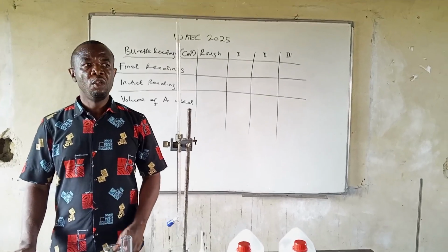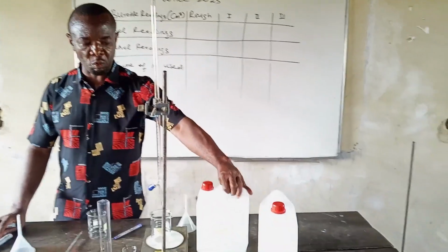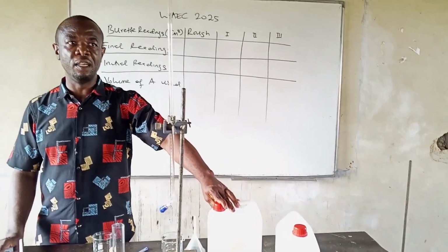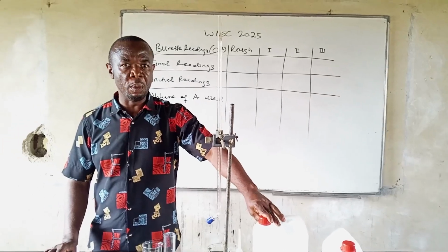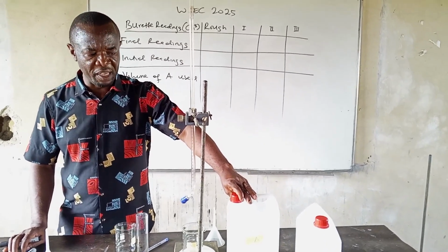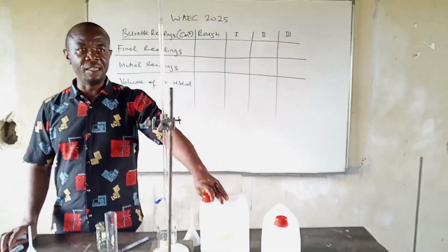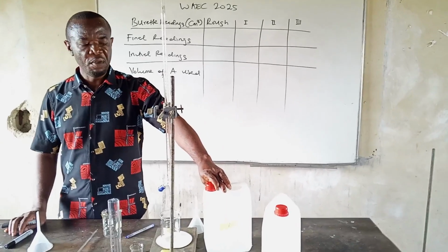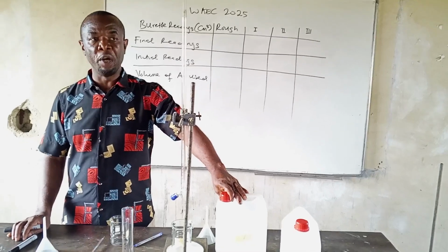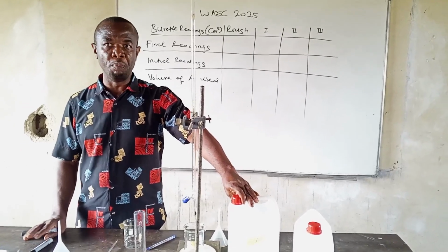So having done that, in this practical titration exercise, we are given solution A. Solution A is what we have here, HCl acid prepared by dissolving 8.6 cm³ of HCl inside 1000 cm³ or 1 dm³ of water. When we prepare this chemical, we use hydrochloric acid from BDH, British Drug House company, and the acid has 37% purity and density of 1.18. So that will give us a concentration of about 0.103 or 0.104 mole per dm³.